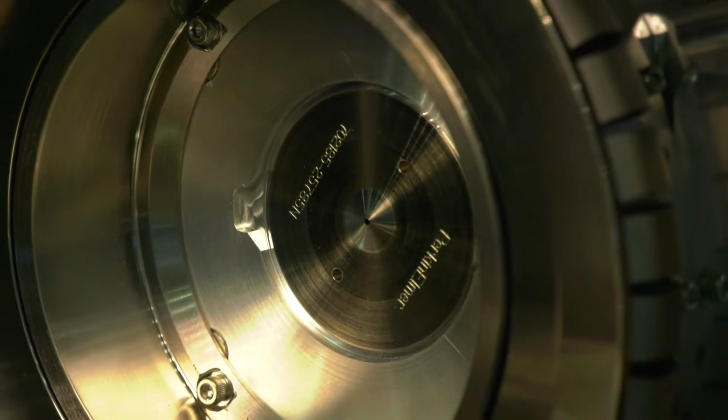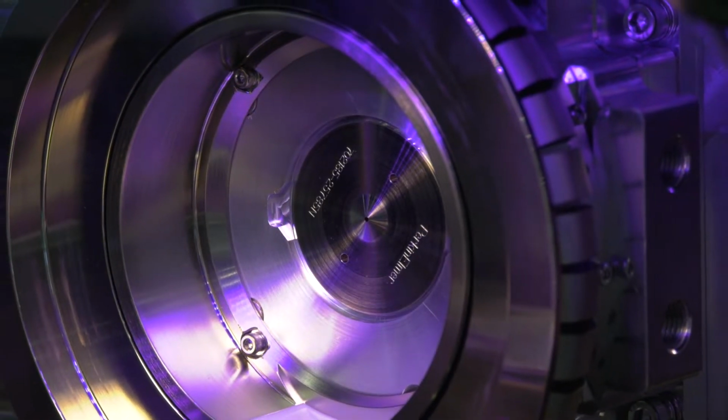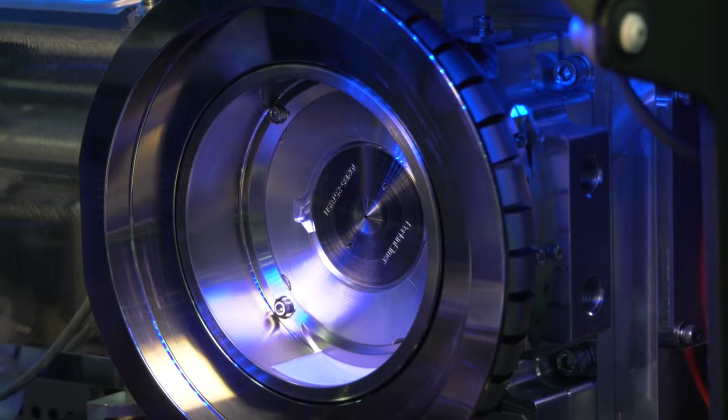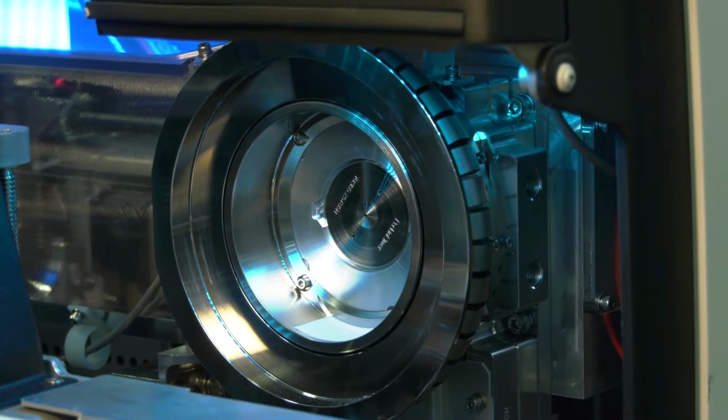Okay. And could you explain a little bit about how these would be used in the semiconductor industry, in the fab or in the lab? So these instruments are actually used all throughout the supply chain, from the mining, getting the materials, purifying, refining the materials. And once we get into the semiconductor industry, from wafer testing, looking at purity, the chemicals that are used. So we look at the purity of the chemicals, we look at the impurities within these chemicals as well. And so they're used all throughout the fab, and then final QA/QC testing as well.